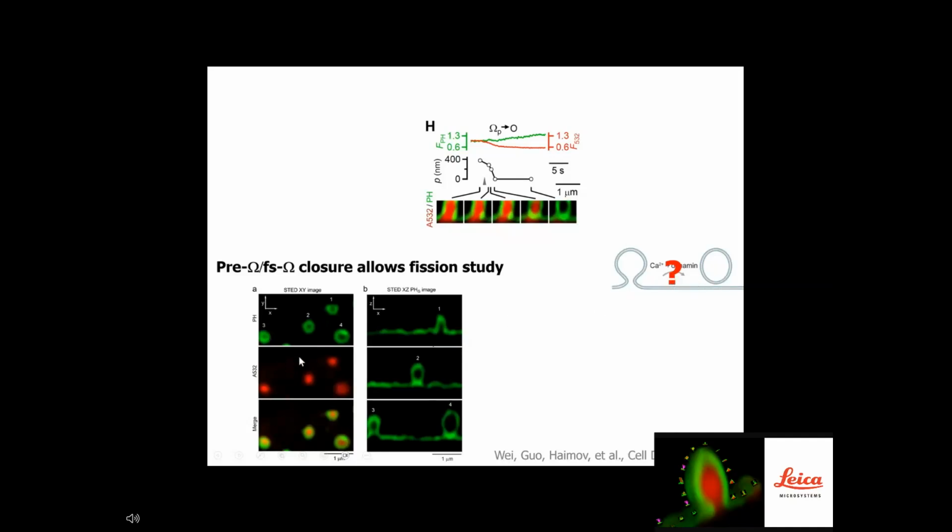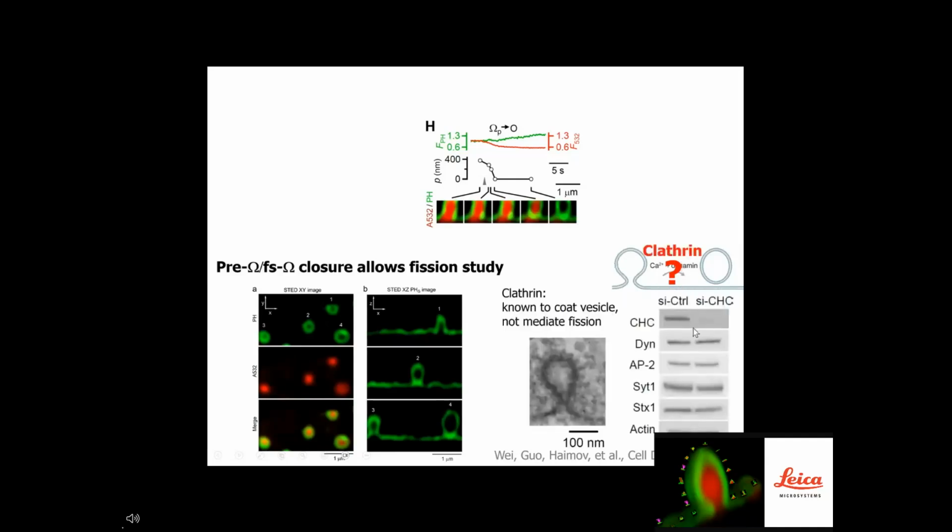Now here I show you more of these preformed omega profiles that are existing in the resting condition. They are waiting for the depolarization signal to close their pores. So we screened the proteins involved in this fission process, and what we found was really surprising: clathrin is involved in the fission process.